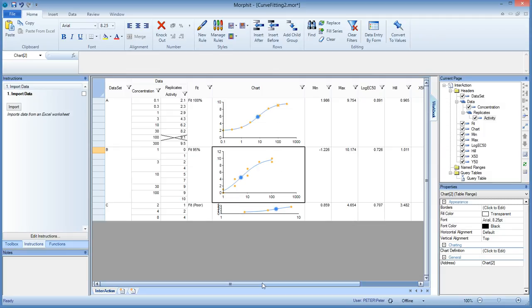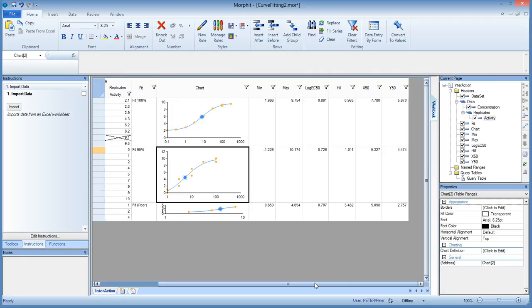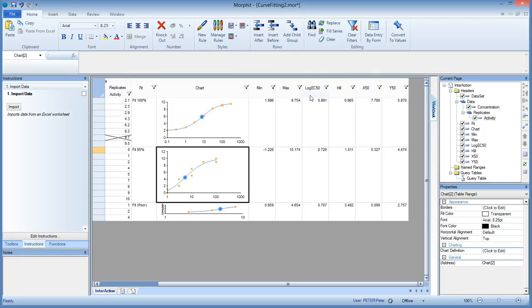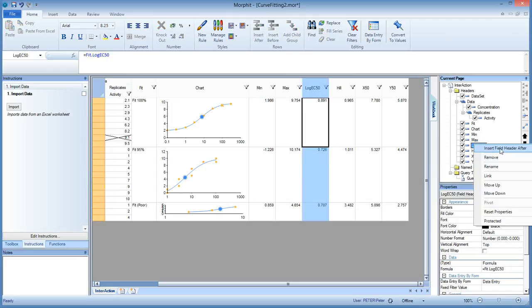So this is now a second nice addition to the chart with some visual feedback. And now it's time to do a third one. Although we are doing a new plot of the parameters itself. So, remember that we now have the expectancy parameters of the log EC50, the hill, the max and the min. But often you also want to have the spread. So the variance basically of these means, these mean estimates.